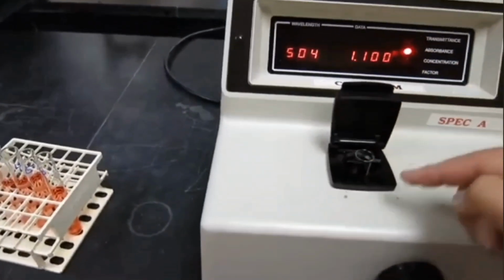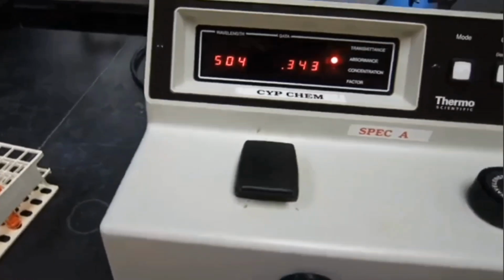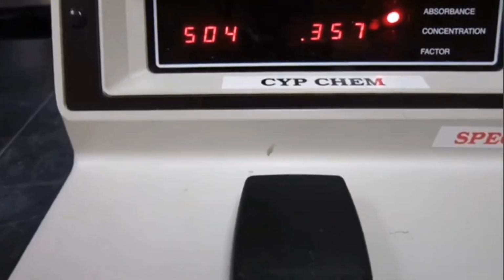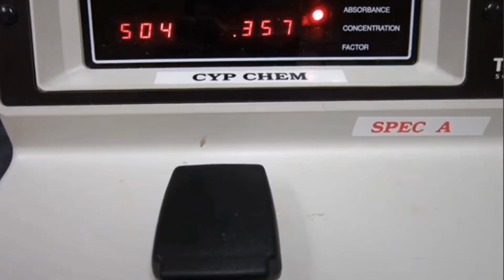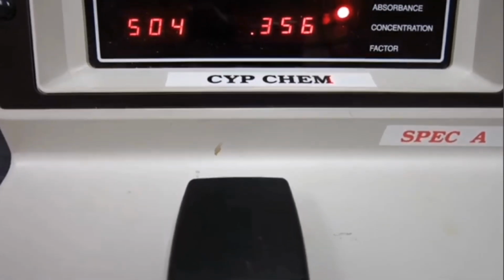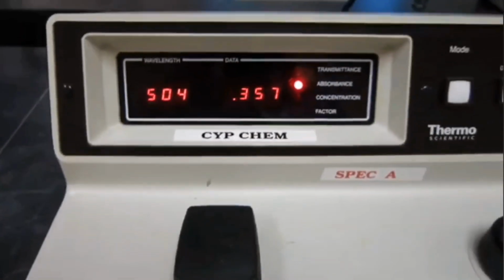And right now what we are doing is getting the absorbance of the diluted Gatorade sample. Now it is very well below 1, the absorbance 1, right? 0.357 or so. So the number that you're going to get, which is the diluted Gatorade sample absorbance, you're going to write down that as well. But we are not going to use that for our calibration curve.